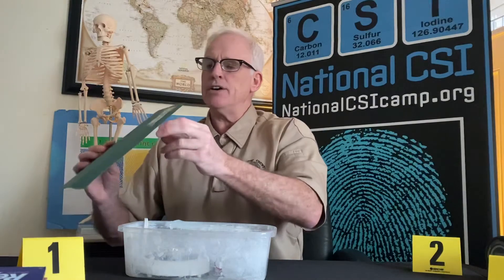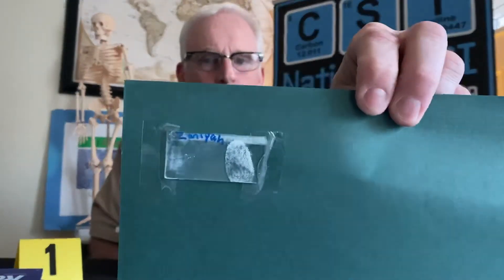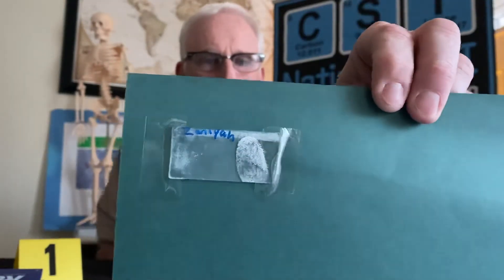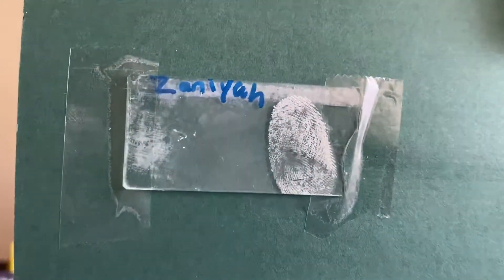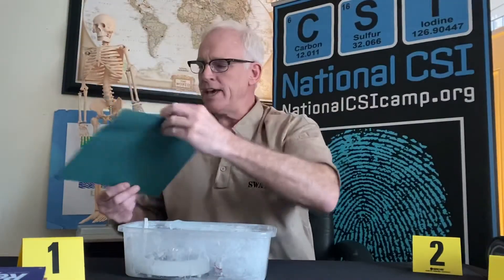Take the lid off — normally we would be wearing gloves and a mask — and remove whatever you were trying to fingerprint. There should be white fingerprints on it. Here is a glass slide from a student, and you can see on there — if you zoom in, you'll actually see the white ridge detail that the fuming developed. You can screen-capture that if you need extra time to look at it. It was a very good print captured during this fingerprinting exercise.